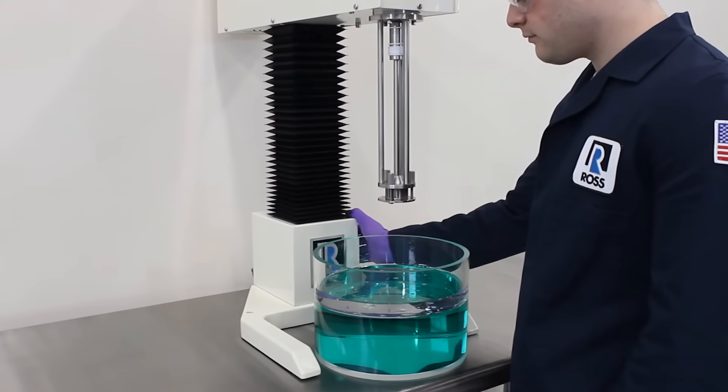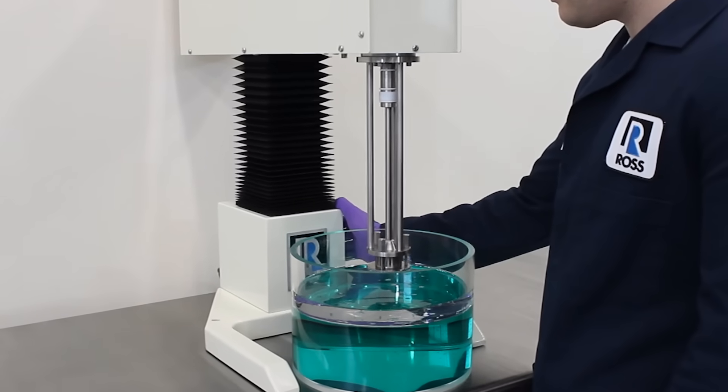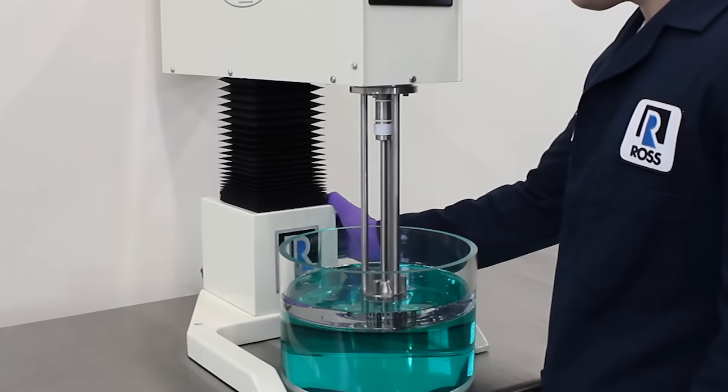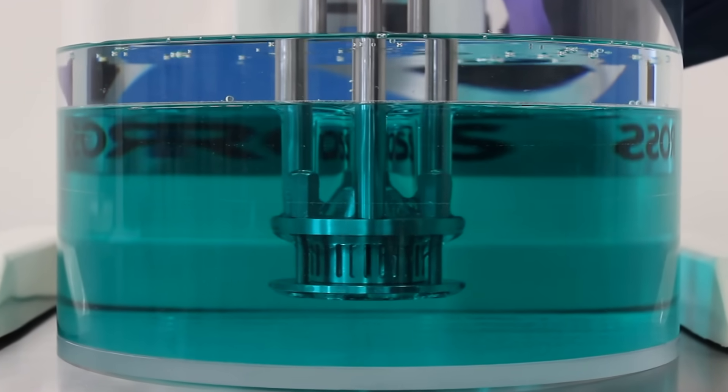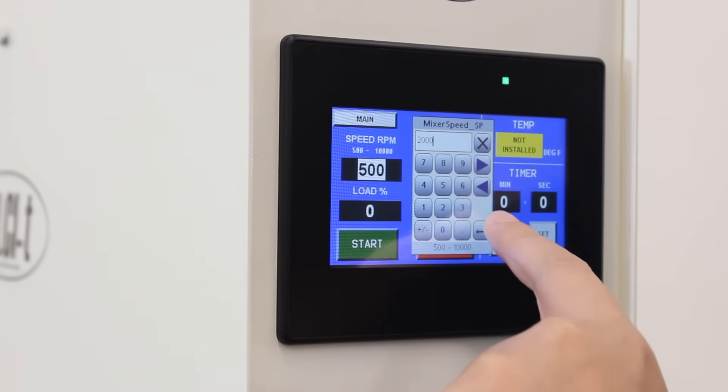Using the Ross High Sheer Mixer is simple. First, lower the agitator assembly into the mix zone about three inches from the bottom. An operator then enters the desired speed and presses start.